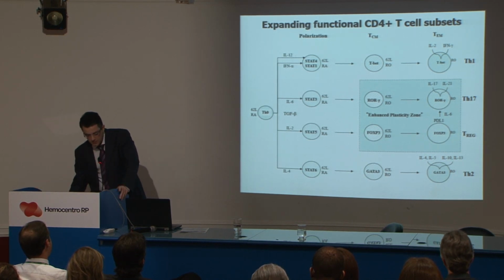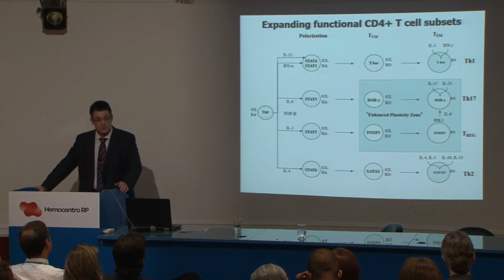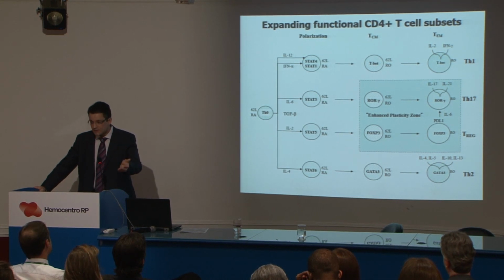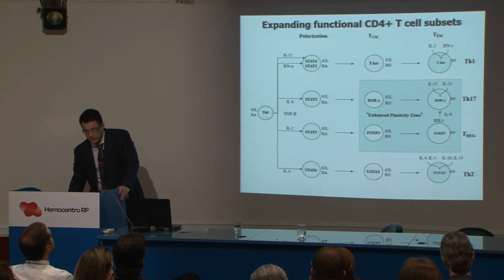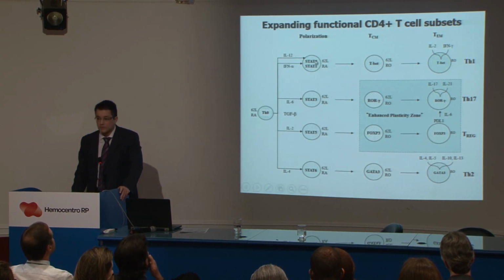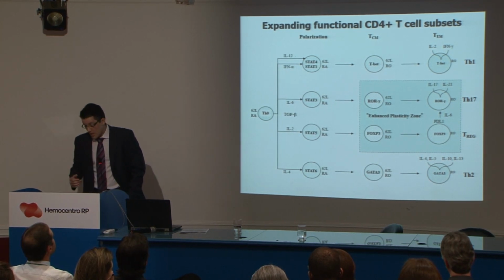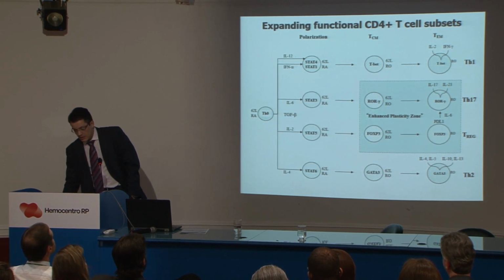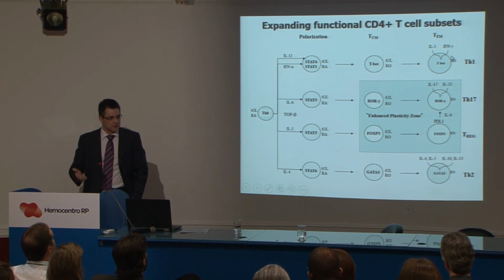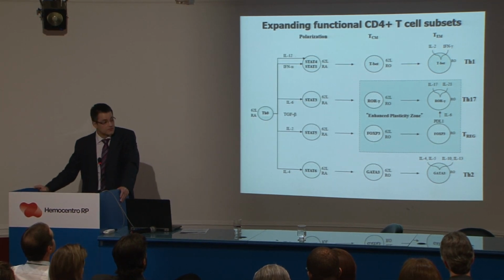You can see here on your right, these cells are CD62L and CD45RA, so that means the cells are naive cells. It's very undifferentiated cells. And if I put the cells in culture with interferon alpha and IL-12 together with CD3, CD28, and I expand that for 6 days, 10 days, 12 days, I suppose that I have at the end of my culture TH1 cells expanded.